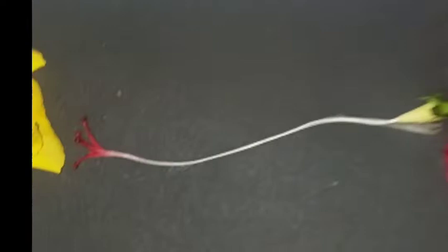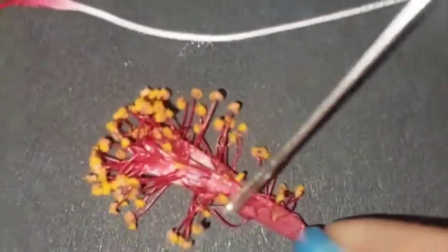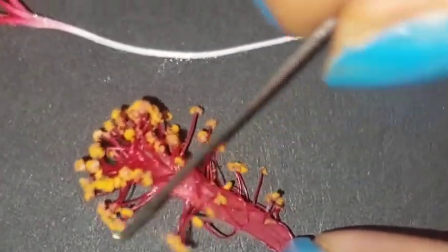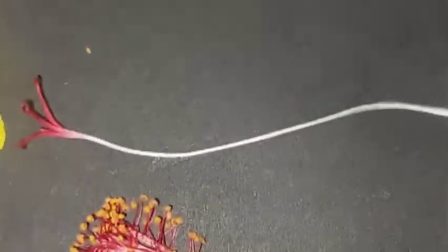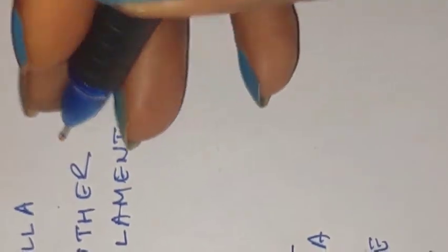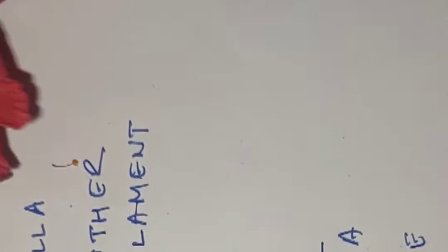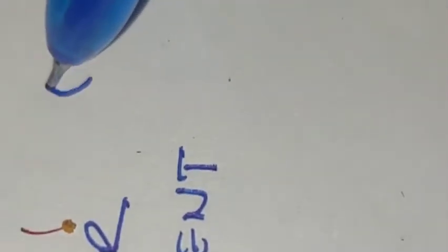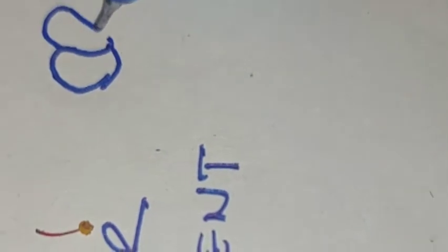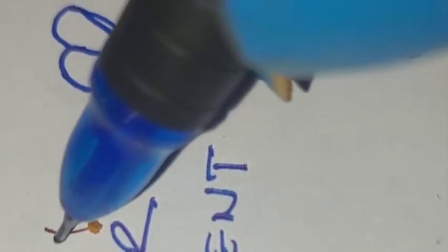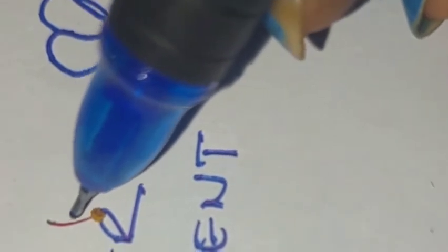This is stamen and this is anther, this yellow color. Its structure is, this is anther. Its structure is so tiny that it's not able to put it. This is filament. The anther has this kind of structure and this is filament. I have separated it.